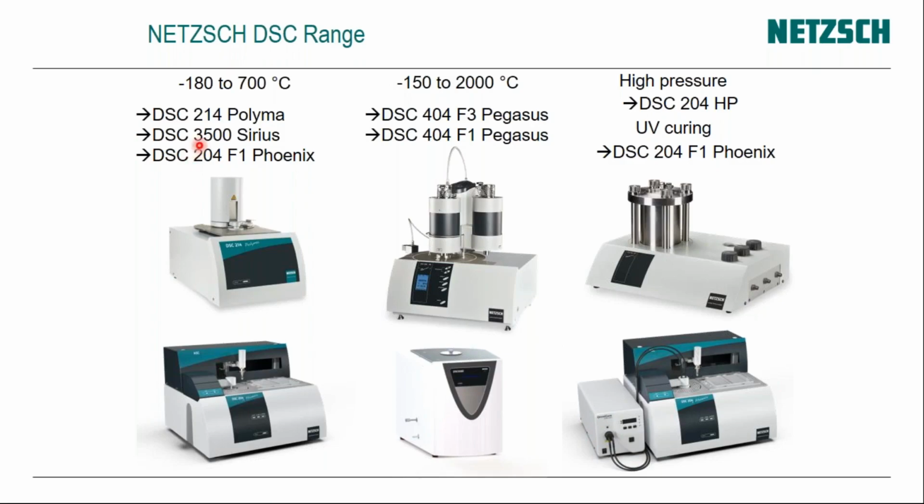So the equipment we have here for low temperature is the DSC 214 Polyma, which is here, and the DSC 204 F1 Phoenix, and all these are low temperature DSCs.